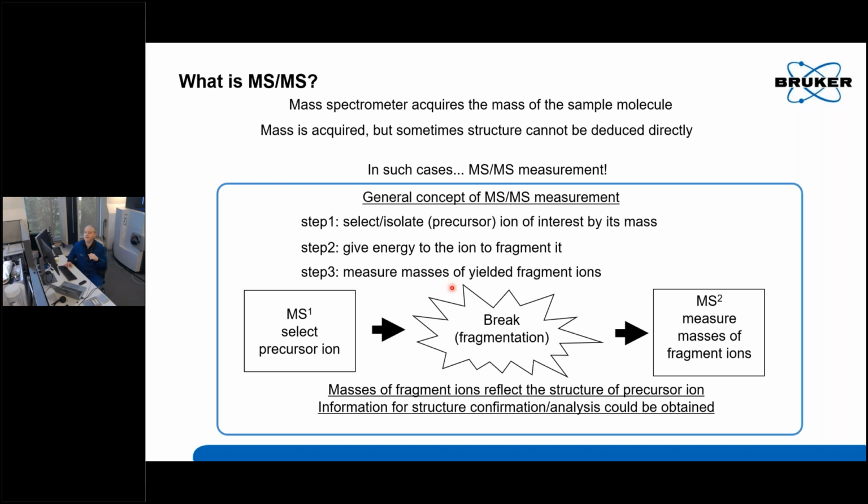And then we're going to acquire some MS/MS data. So what MS/MS is: isolating an ion, adding extra energy, and fragmenting it. And that would be useful if we cannot determine the molecular structure or the microstructure from mass alone or any type of trends that we observe in the mass spectrum. So we're going to, again, isolate that precursor. We're going to give it energy. It's going to fragment. We're going to detect those fragments. And then we could use those pieces to reconstruct the intact parent ion.